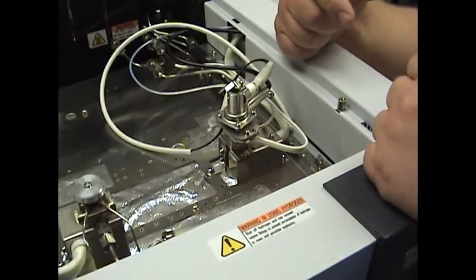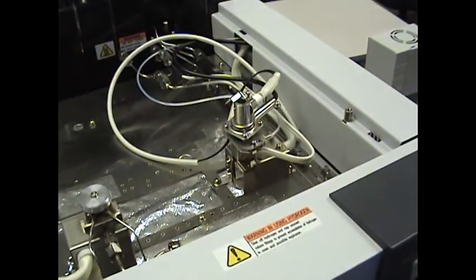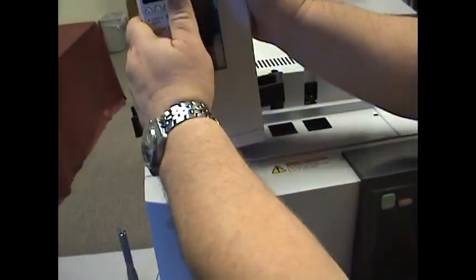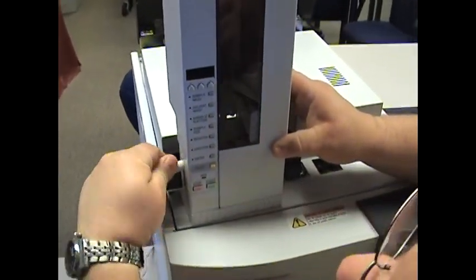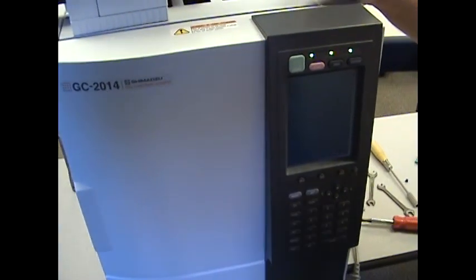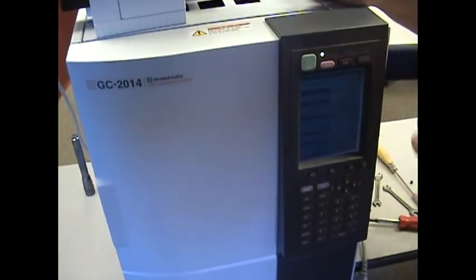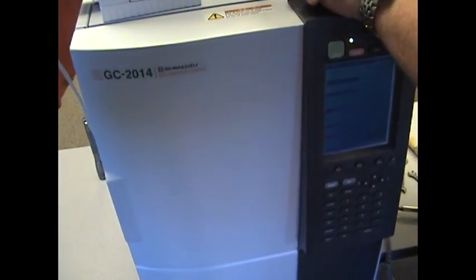Now you're going to want to cook that jet out for a while. Once you have everything done, put the instrument back together again, put the injector back on, plug it back in. Turn your gases on, turn your GC on, let it come up to temperature, and raise your injector and detector temperatures to allow some time for that detector to bake in. Make sure your flows are on. That's all there is to it.